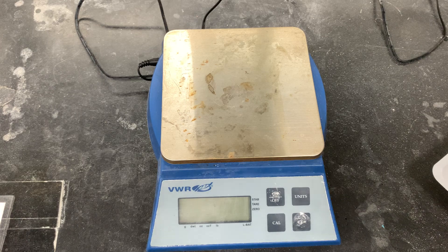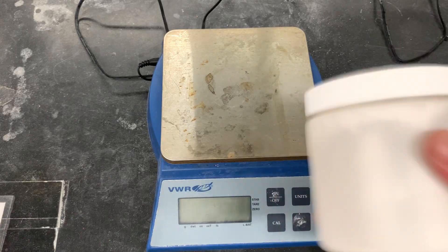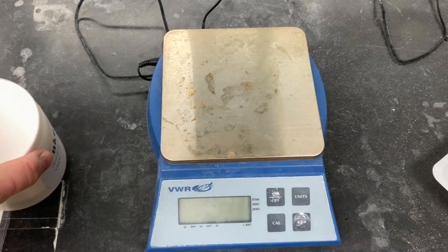Even though it's a solid, they can basically end up at the bottom. So whenever you get this unknown, screw the cap on tightly, shake it up a lot, and you're good to go.